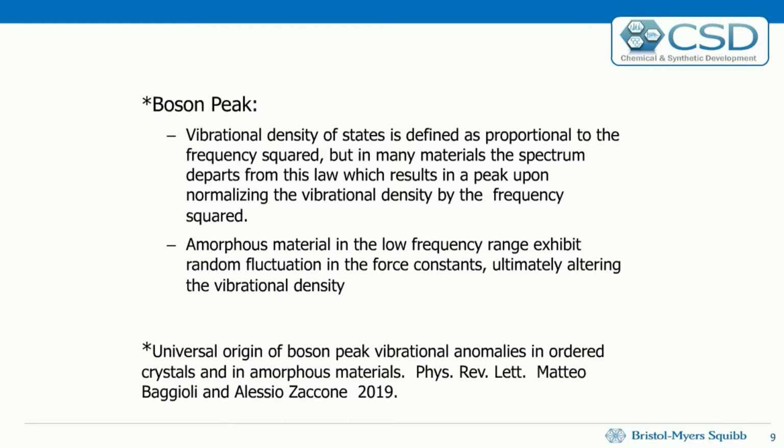So in the crystalline lattice, and this is some of the current discussion, and I have a really good reference there that's very up to date on new discussions on what gives rise to it. And a lot of the feeling is it could be in that crystal lattice, there is actually a competition between the elastic mode propagations and diffuse dampening. So there's a lot of vibrational changes and competitions going on when you're in this amorphous state.